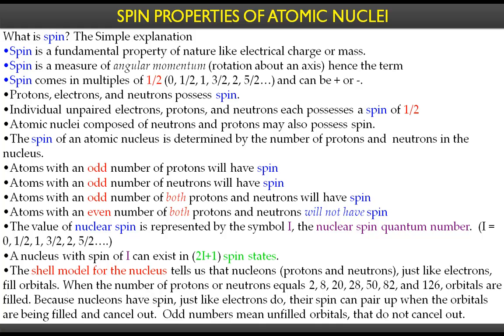Carbon-12 has an even number of protons and an even number of neutrons, so the net spin is cancelled by those even numbers of nucleons. So the carbon-12 nucleus does not have unpaired spin. That is the reason why carbon-12 cannot be observed in NMR spectroscopy. Or, to put it another way, carbon-12 is of no use for this particular spectroscopic tool, because it doesn't have a magnetic momentum.